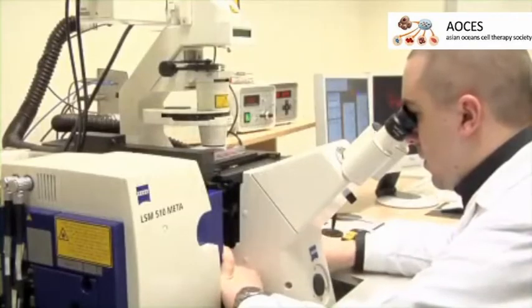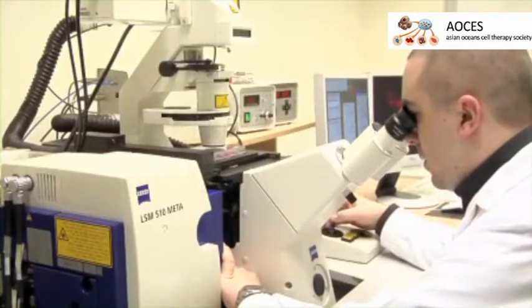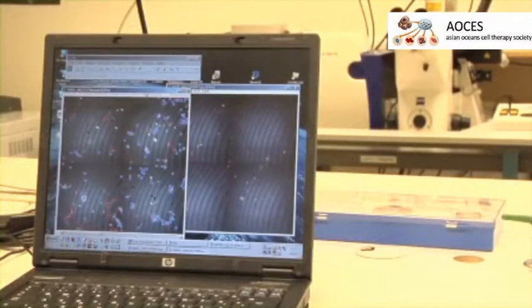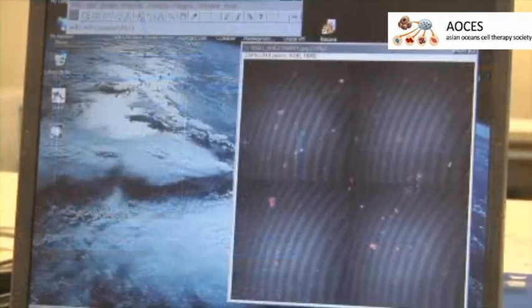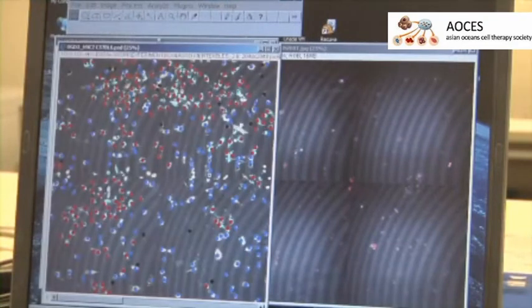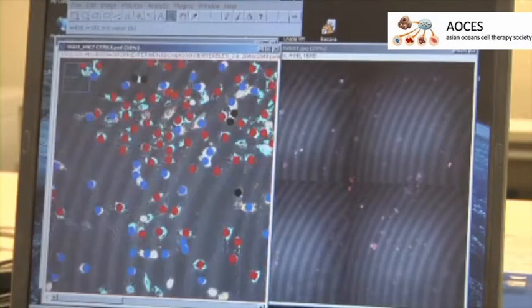In case of co-cultures, mesenchymal stem cells are distinguished from H9C2 cells by the respective fluorescent cell labeling. This way it is possible to detect cell fusion and cell-to-cell contact sites. The ratio of dead cells can be evaluated in 4 independent fields of view using a 10 times objective for each culture in a blind fashion, which gives a reproducible cell count result.